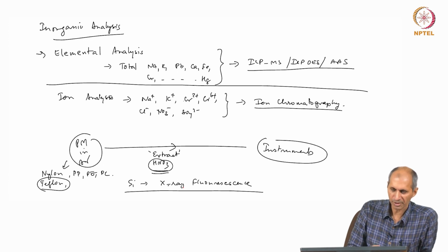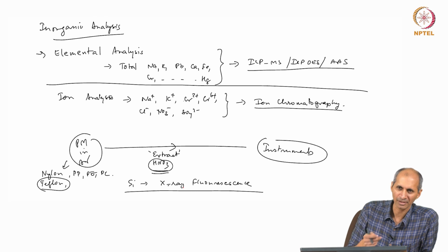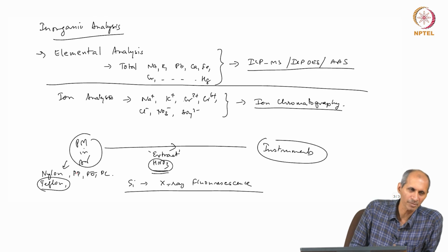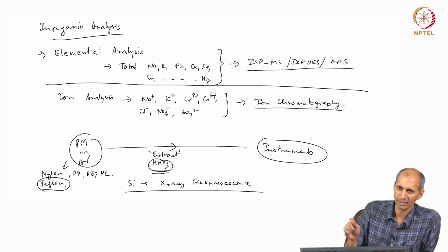You can also use Teflon for mass measurement, because glass fiber is a very delicate fiber, it may tear and all that. So, Teflon can be used for actual PM measurement. You can collect the sample, take it and put it in a balance and take it out. That is actual full mass measurement. When we say mass measurement, it is combined mass, it is PM mass. This what we are talking about is the composition analysis.